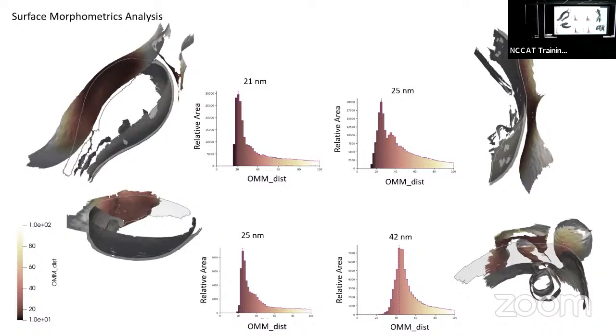Is it always the same part of the mitochondria that... This is also dynamic, so they're constantly forming and disassembling. Yeah. And the mammalian contact sites are huge. They can be microns long. So these are slices of the actual thing, but it's a trade-off between resolution and volume, right?